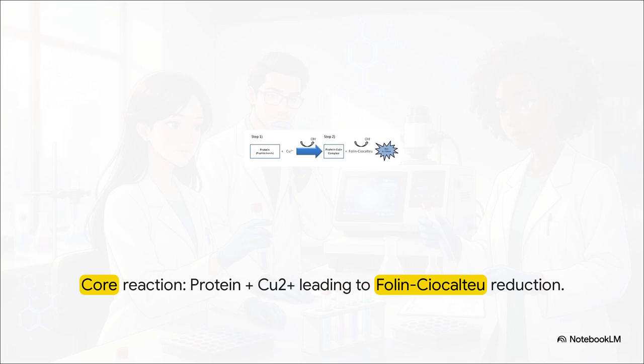In step 1, we introduce our protein, which of course contains peptide bonds, to copper 2+ ions in an alkaline or basic environment. Those peptide bonds basically grab onto, or chelate, the copper, reducing it down to copper 1+ and forming this really faint light blue complex. But honestly, that's just not sensitive enough on its own. So we move to step 2.